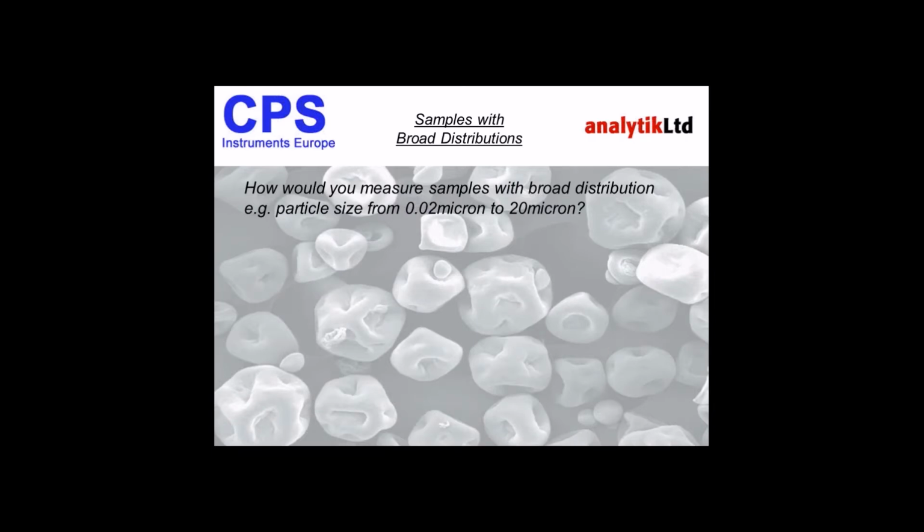Great. So occasionally we do get users who have samples which have a very broad dynamic range. Let's imagine you have a sample with some very small particles, some fines in there, let's say 20 nanometers, and some very large particles going up to 20 microns. How are you going to analyze this sample? Because if you use a fixed speed, it's not going to work for both ends. A slow moving disk is great for the big particles, but the small particles will take forever to sediment. And vice versa, if you use a very fast speed, great for the small ones, but the big ones will just fly by without being seen.